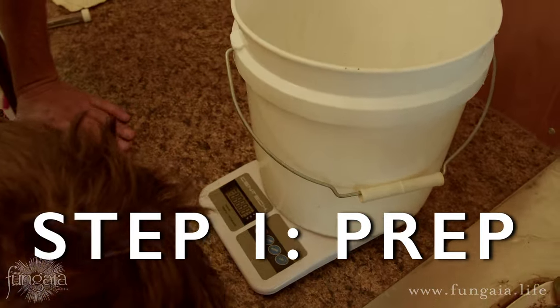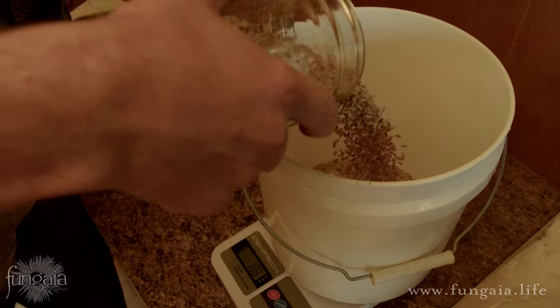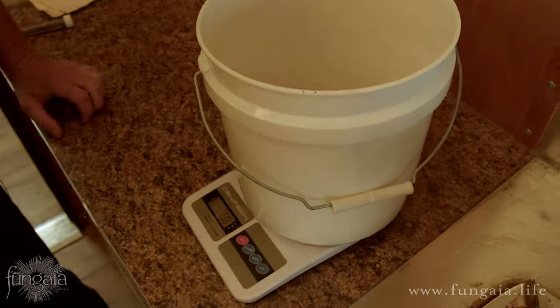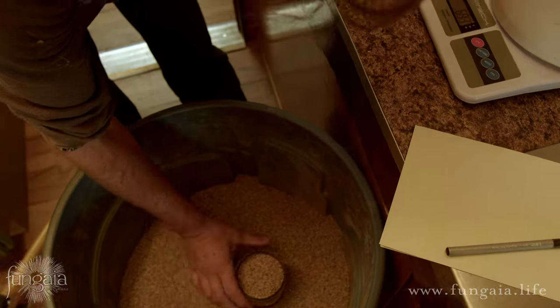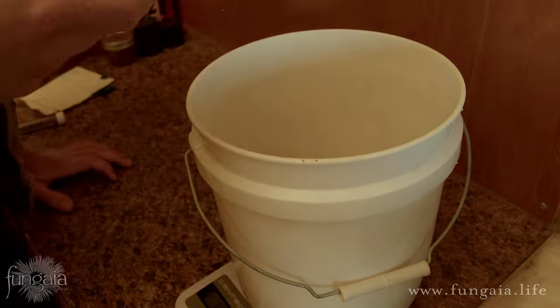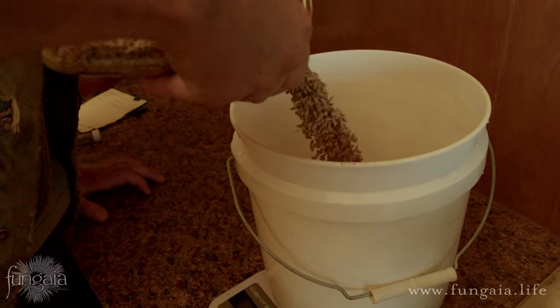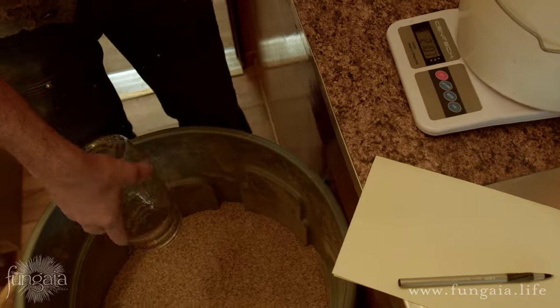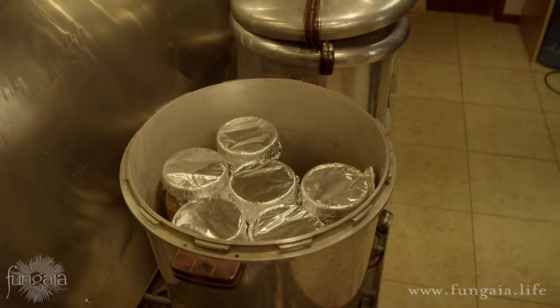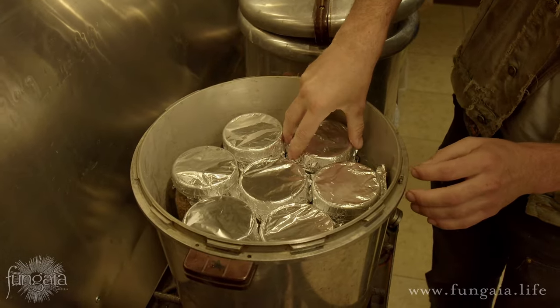Our first step is to measure out our dry grain. At this stage it's easy to get ahead of ourselves, so there are a couple things to keep in mind. Sterilization is usually the bottleneck, so we want to avoid cooking more grain than we can fit into our pressure cooker. You'll have to see what you have and how many jars you can fit, then calculate it based on volume. A standard Presto canner usually fits seven one-quart mason jars.